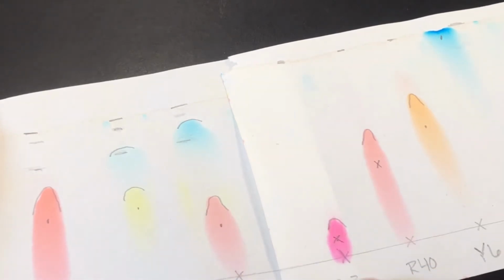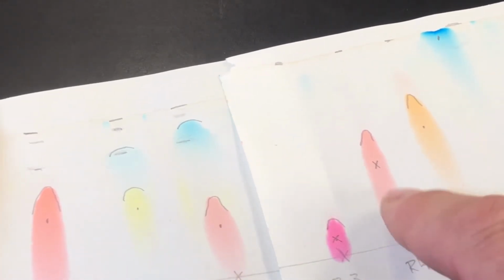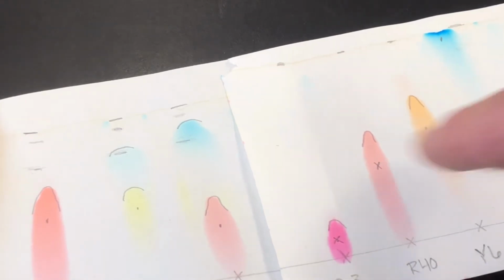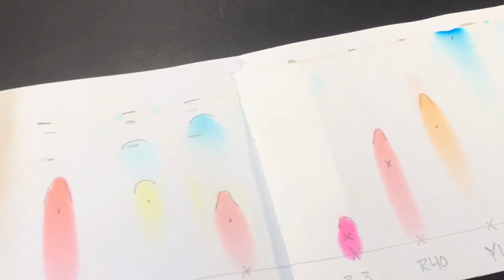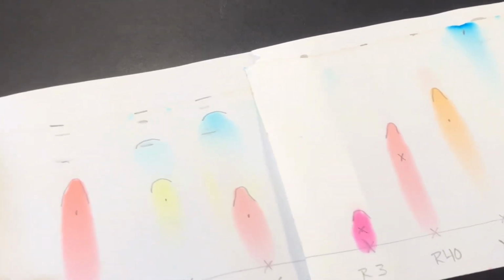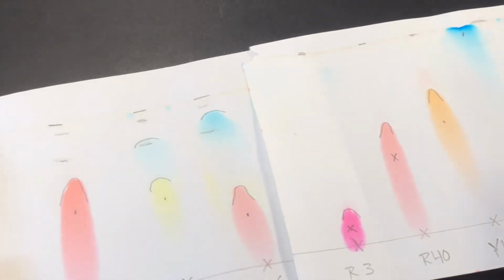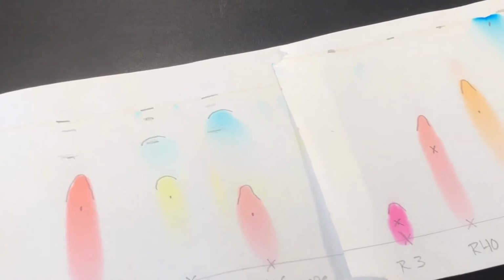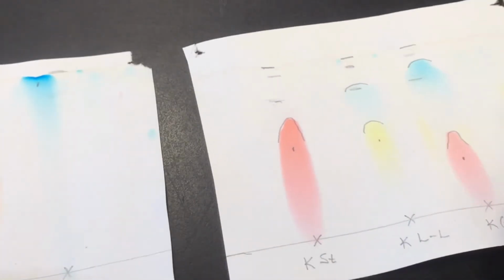I don't know, the color looks a little more like the red 40 instead of the red number 3. The yellows still just don't match up, do they? So again, if we did this, we may want to include a yellow number 5 and see how well it would match up instead of yellow number 6. We just can't get the yellow number 5 in our lab to ever dissolve well enough to get any results. But somehow other people do, because I think that's what that is.